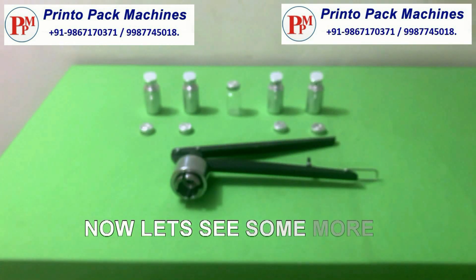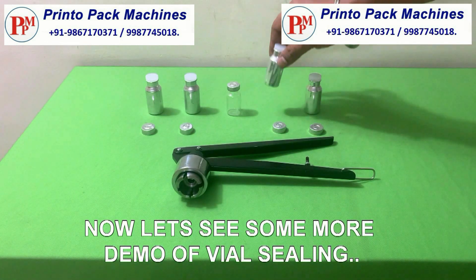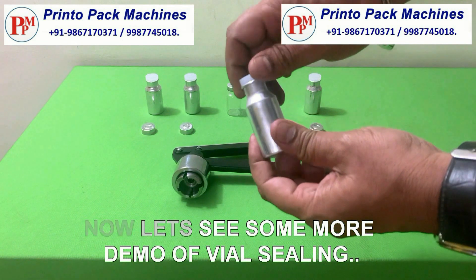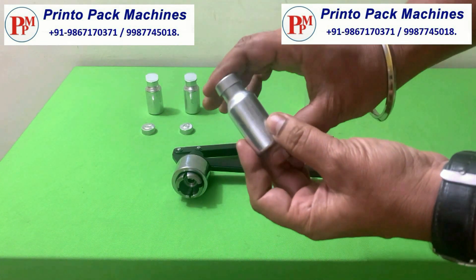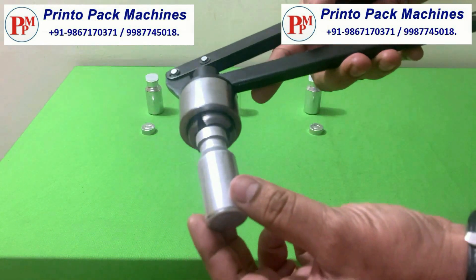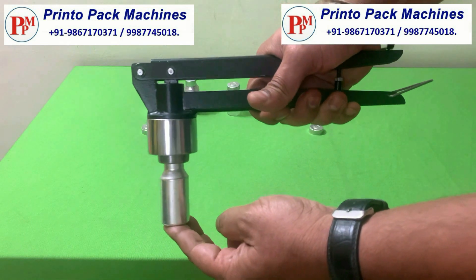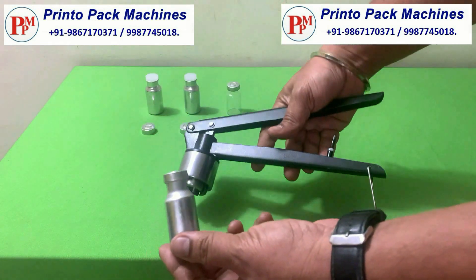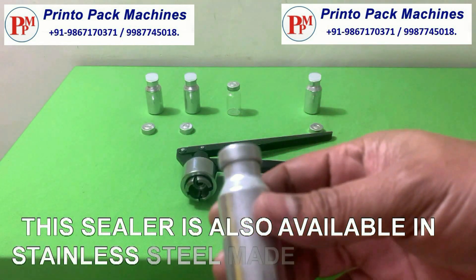Now let's see one more demo of vial sealing. This sealer is also available in a stainless steel GMP model.